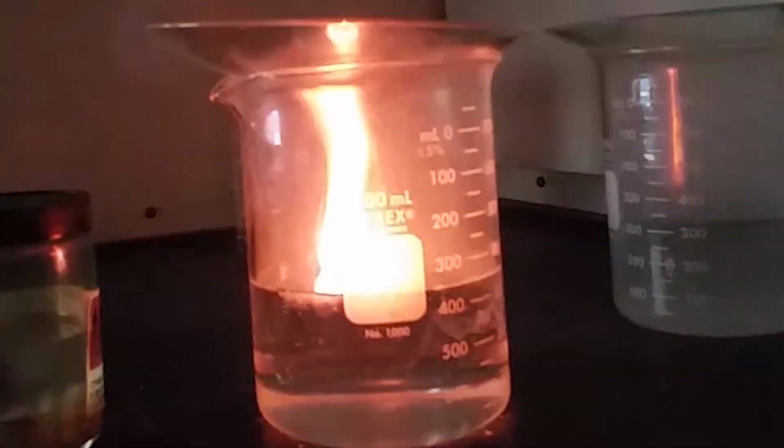So as you can see, the potassium is a lot more dramatic in terms of its energy release. It doesn't last quite as long. It reacts much more quickly than sodium. And that's it. So that concludes the instructor demo. Please make sure you make your observations of what you saw, and then some explanations for what might have happened in this particular exchange.